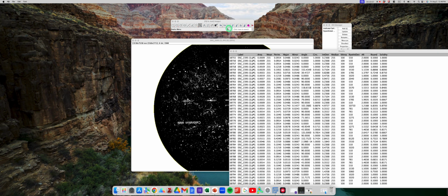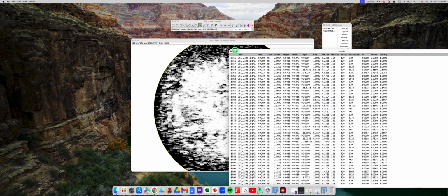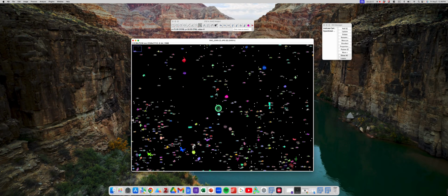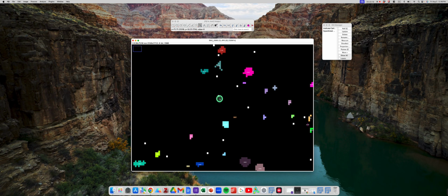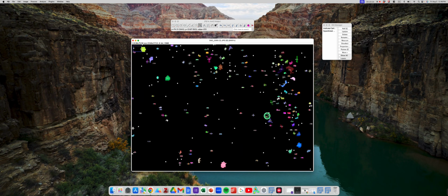Here's the loading bar, by the way. Okay, so we have approximately 39,000 particles that are counted. You can zoom way in, and we can take a look. So these tiny ones, they might be microspheres, but they're probably not. But these are all clearly microspheres.